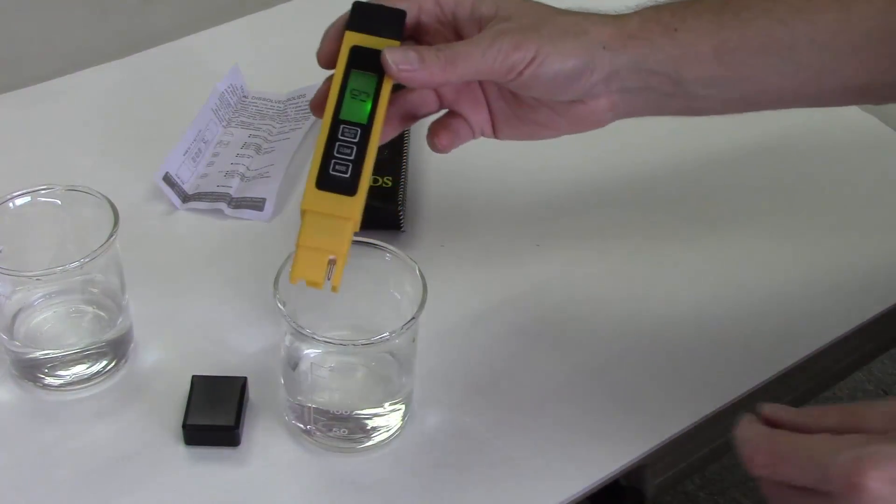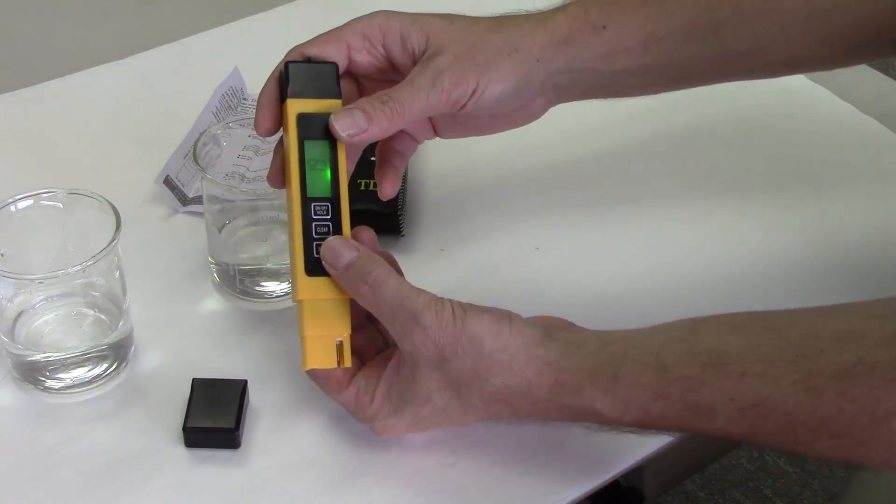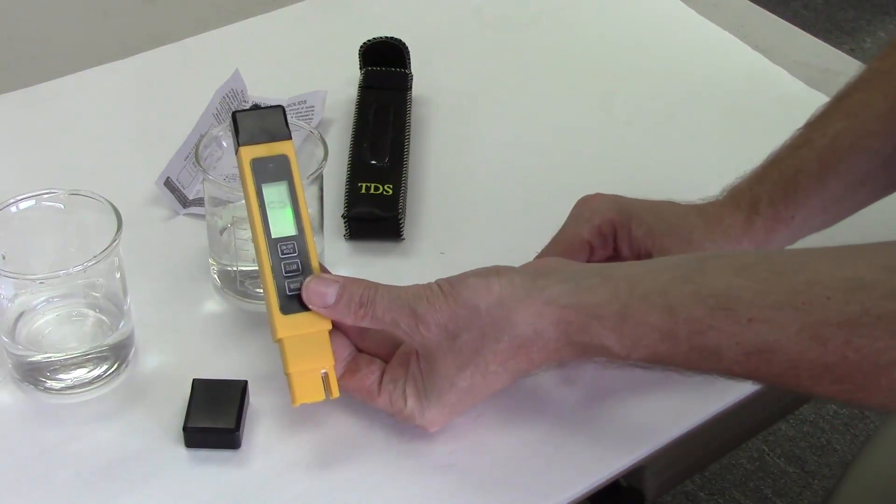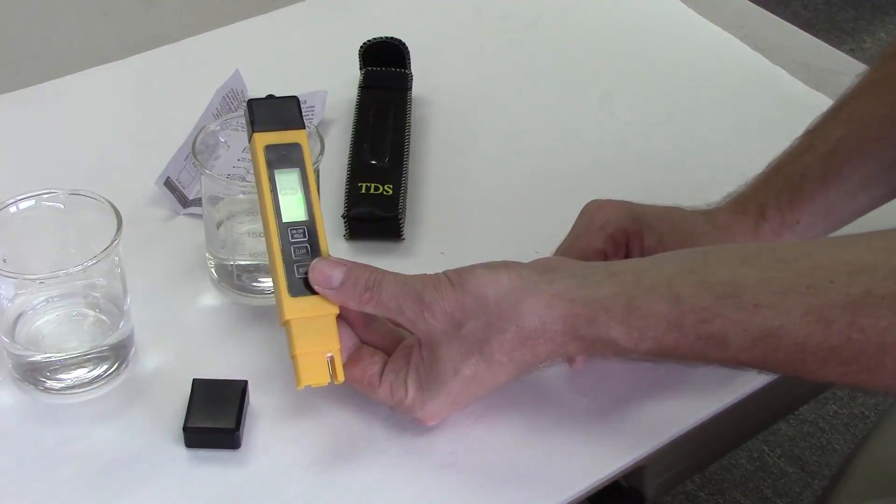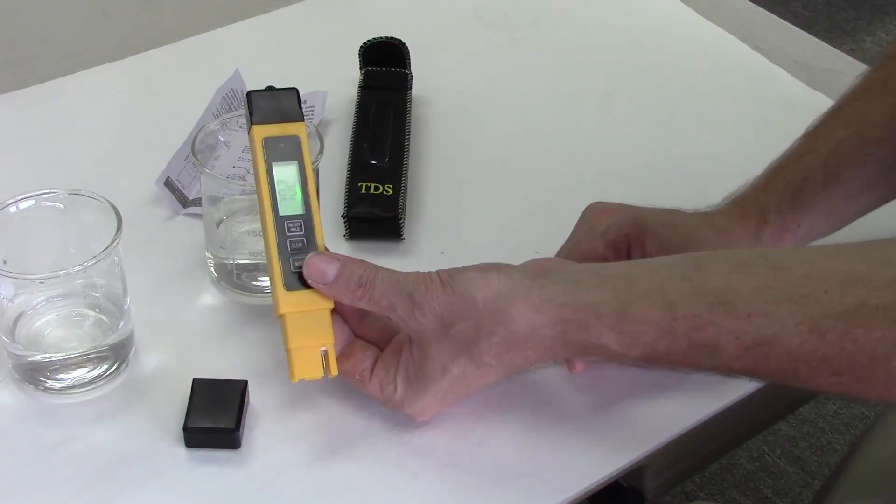That's a very low amount of total dissolved solids, as you would expect. Hitting the mode key will scroll you through the four options. You have total dissolved solids and electrical conductivity, and then you have temperature in Celsius and temperature in Fahrenheit.